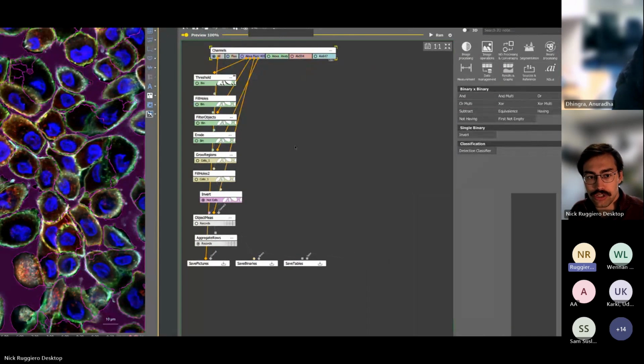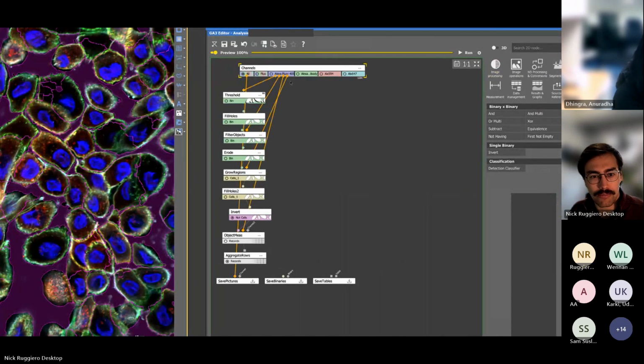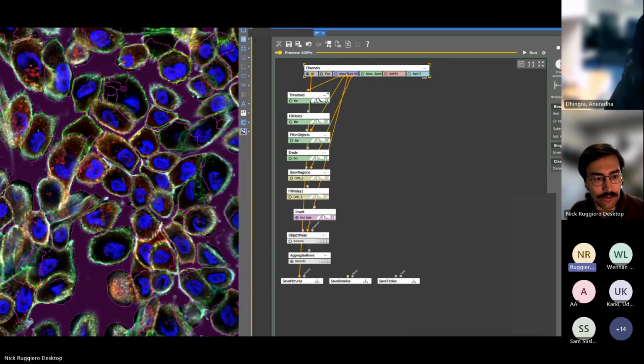I know that when I first started doing this, Lauren may have adjusted these slightly, but I know she had to leave.